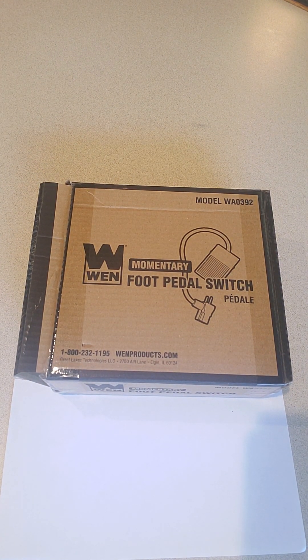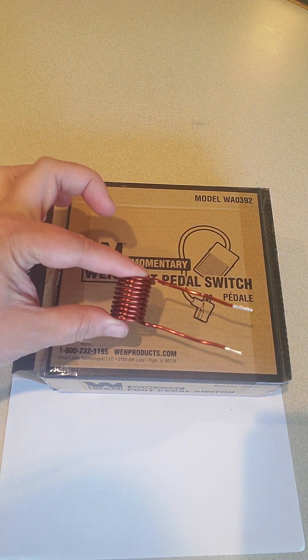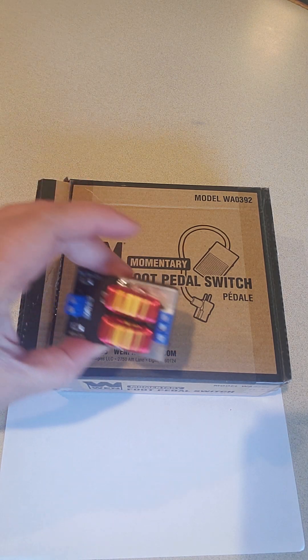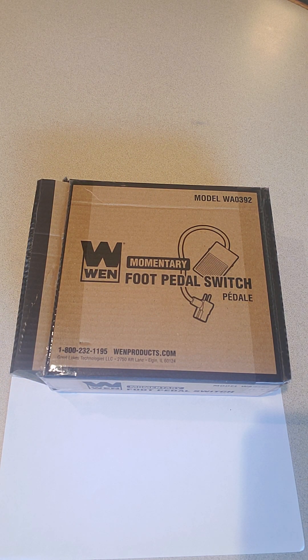Last but not least — this is not necessary, but I highly recommend it — and that is a foot pedal. The foot pedal lets you plug this unit into it, and then the foot pedal plugs into the wall. Every time you put your foot on the pedal, it'll put power to the unit, and when you take your foot off, the power goes away. This is important because there's not really an on/off switch for our induction heater, and if you continuously run power through it, eventually it's going to heat up. It's actually the little board unit that will get hot — electricity is coursing through it. To increase the life expectancy of the heater board and reduce the risk of burning yourself, I highly recommend the foot pedal so it's only on for the few seconds you're sterilizing your scalpel.